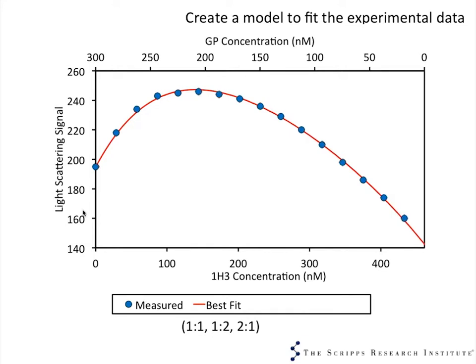So if the model is correct, the fit of the curve based on this model should match very well with the experimental data points. And you can see ours does. So from this we can conclude that yes, the multivalent sites are equivalent.